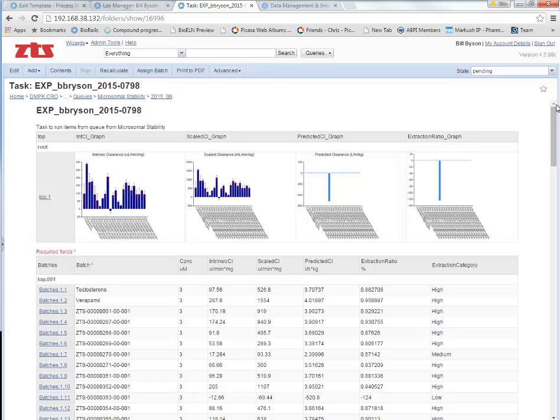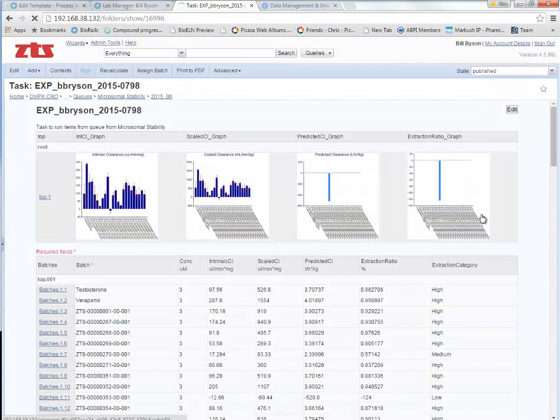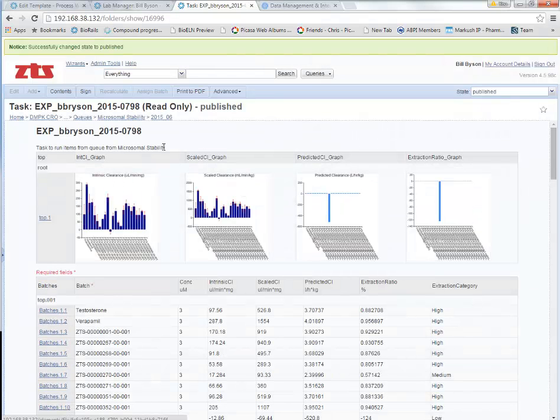That's how you would sign off the experiment, and then of course when it's ready for everyone to see, I'll move it to published, and then that releases the data for other people to be able to go and make decisions on. And those signature events we can control on whether it's published or signed. So that's completed my experiment now.